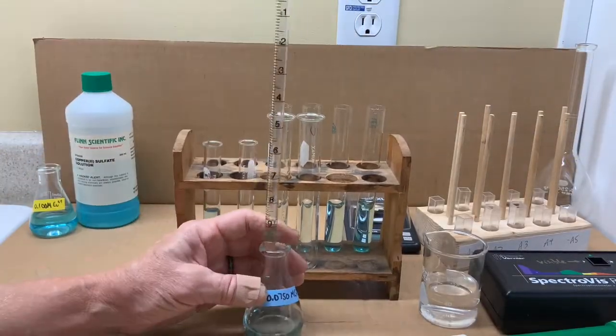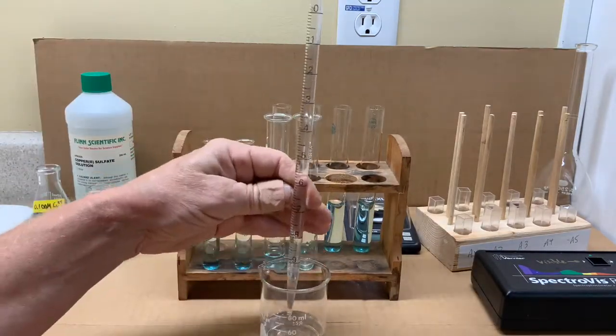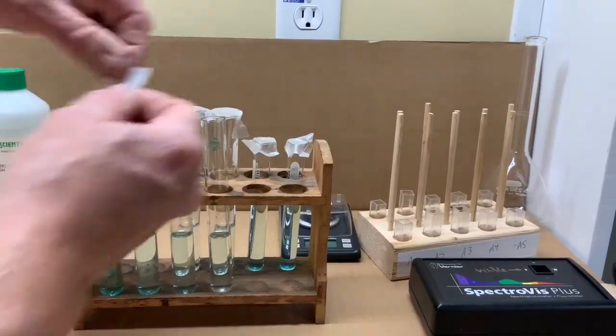That will be repeated for the second stock solution, 0.075, and you can see in fast speed the stock and then the water to again make the four dilutions.